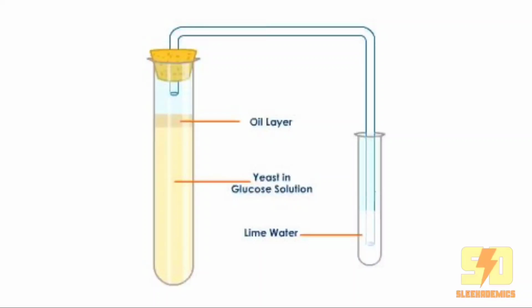So, in conclusion, since oxygen was excluded from the setup and the bubbles of CO2 turned lime water milky, it shows that yeast respires anaerobically and that fermentation has taken place.